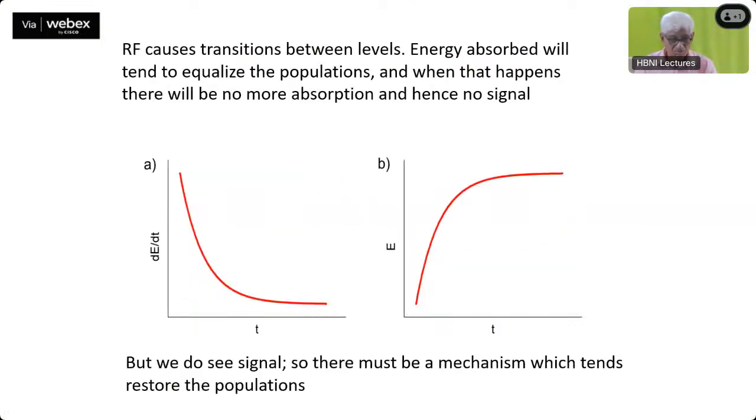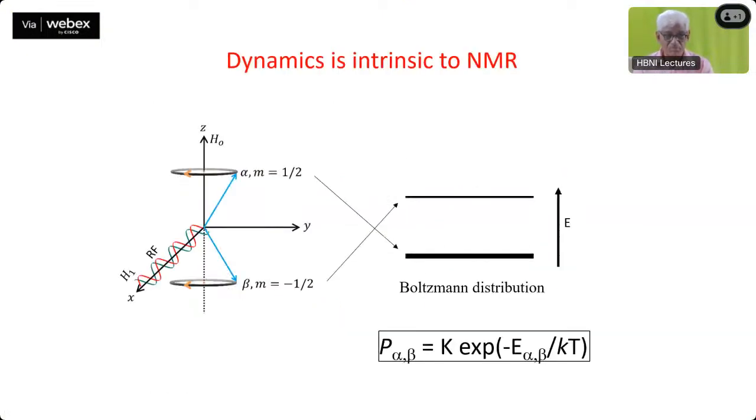Okay, so now we are going back to the basics once more, because this is where we have to see. Now all of you know that you have a particular single spin. Spin I is equal to half. You have two orientations there. There is a precession going around along the magnetic field. So you have m is equal to half and m is equal to minus half. They precess in the anti-clockwise direction in this manner.